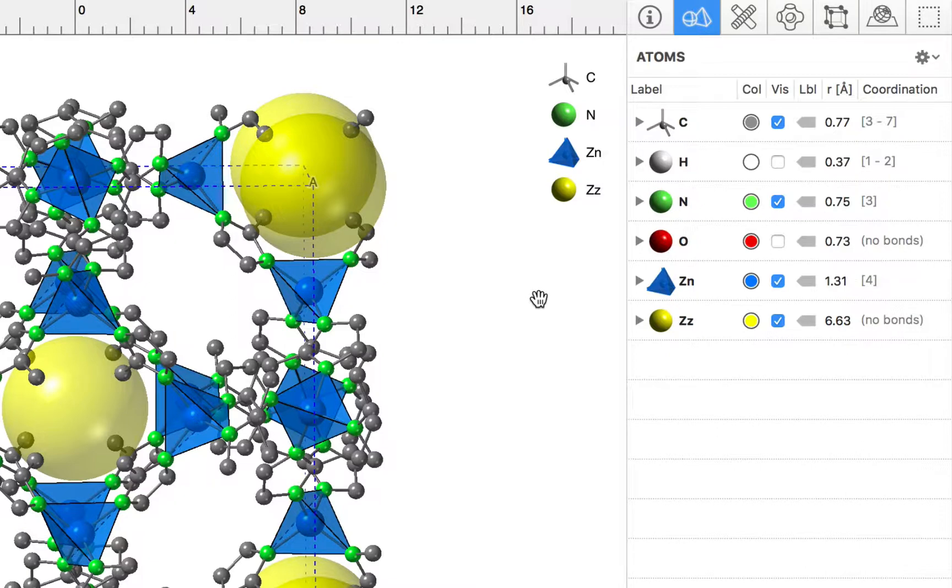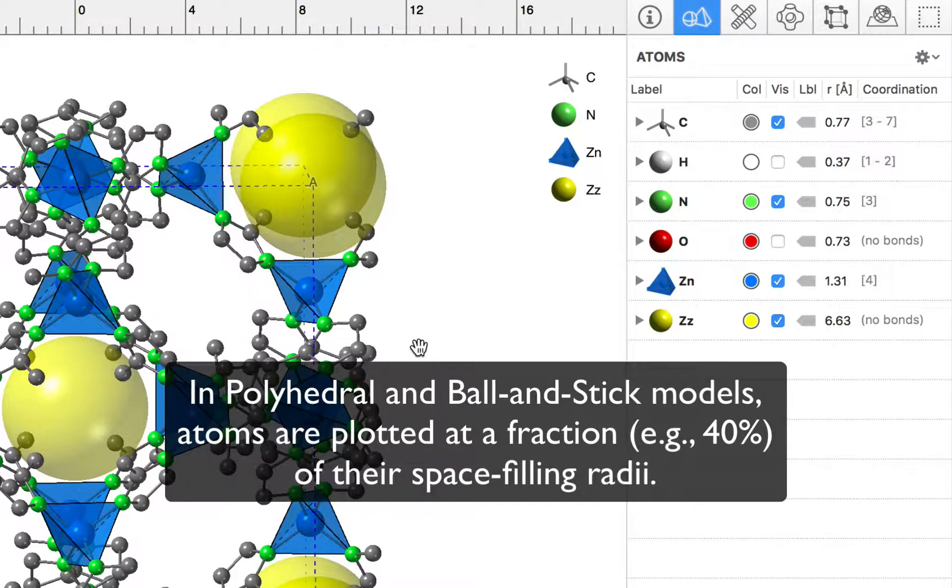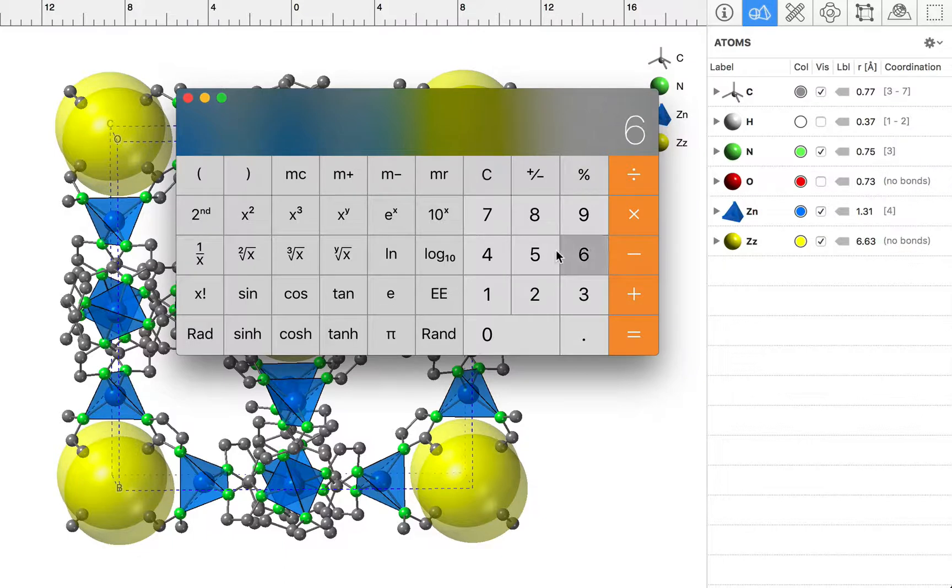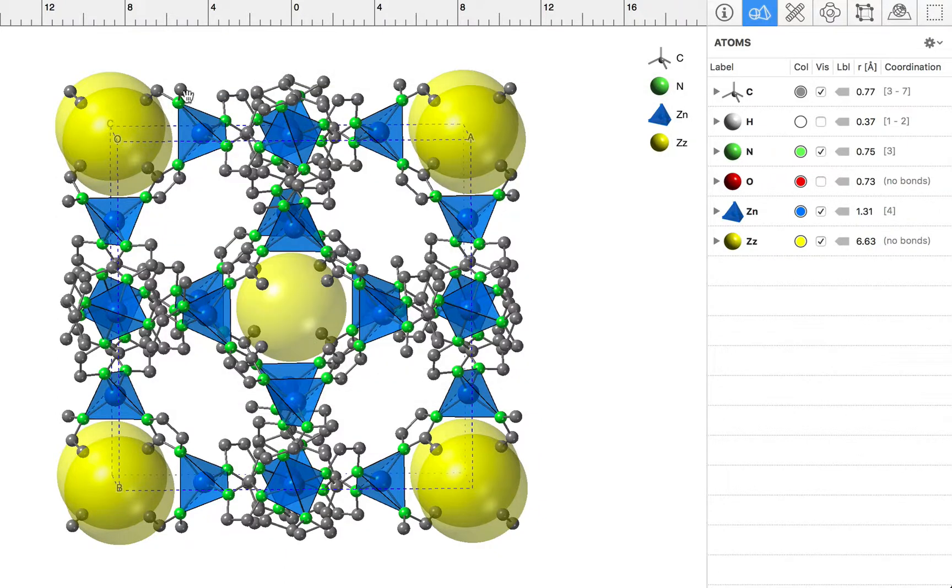Our dummy sphere is 6.63 angstroms in radius. To make that appear the correct size for a polyhedral model, we need to divide that by 0.4, so 6.63 divided by 0.4 equals 16.58 angstroms. We'll just edit that radius.